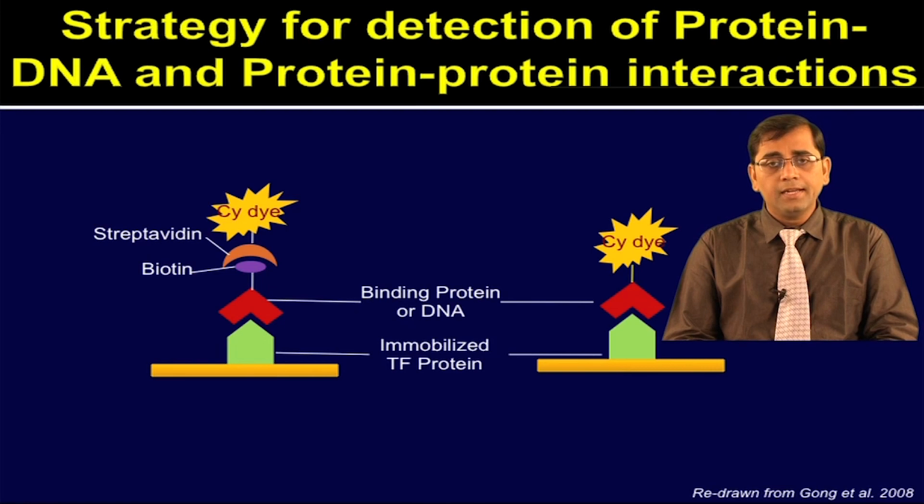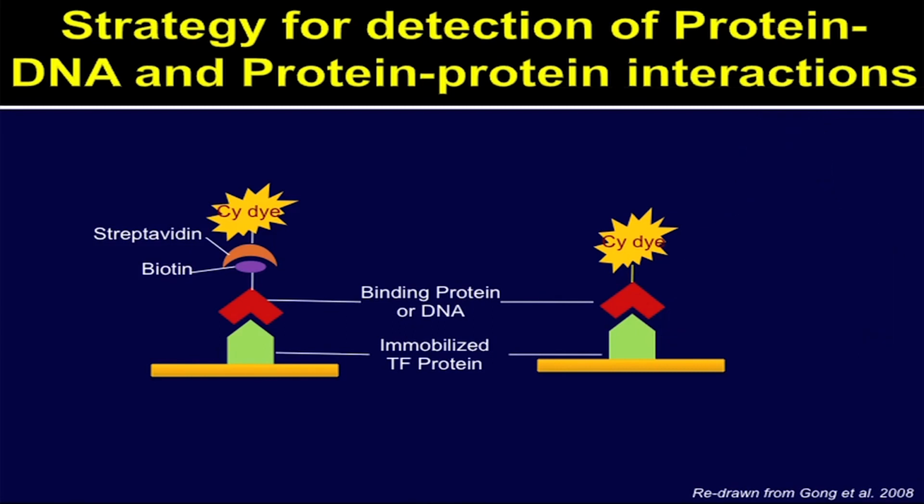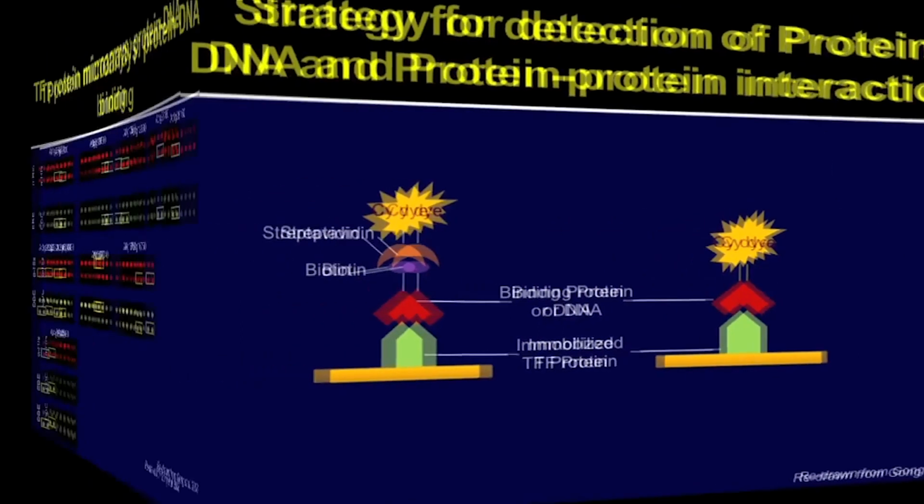Similarly, the right panel shows assay conditions for DNA-protein interactions.